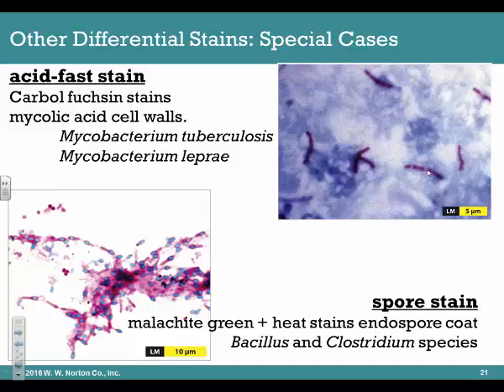Here in the light microscope image on the right are the Mycobacterium examples in this deep red. And just a side note, these are actually several cells all in a chain, all lined up.